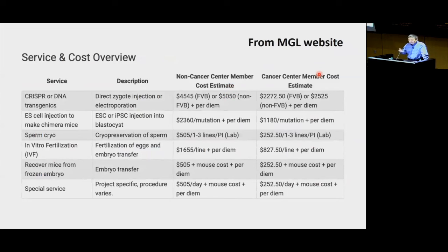But if the knock-in fragment is too big, there's no homologous recombination. So that's also a reason I try to establish 2-cell injection. The 2-cell injection will increase the homologous recombination rate. Hopefully, this can be some improvement if I can do the 2-cell injection.